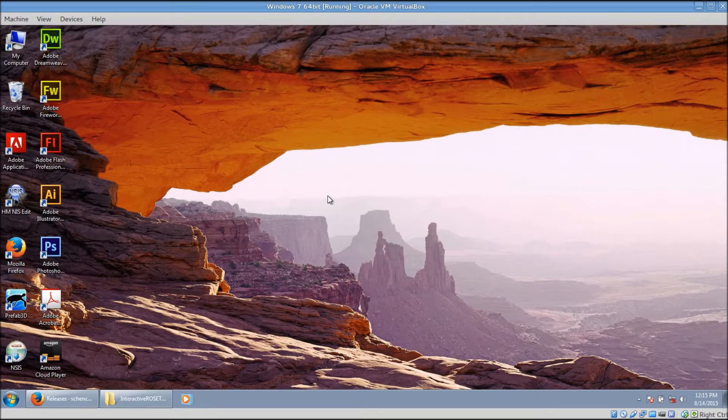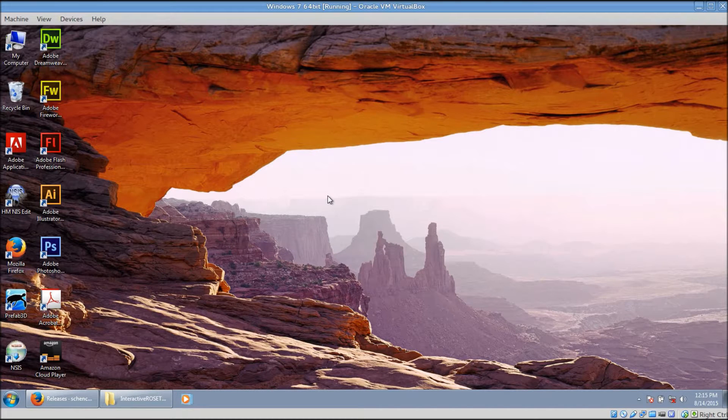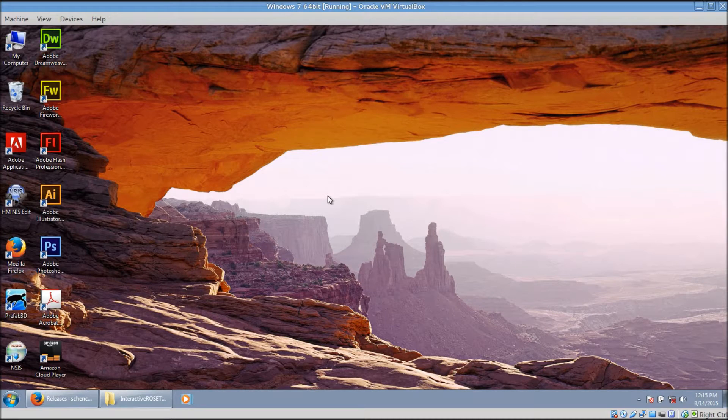Hello everyone. In this video, I will be showing you how to download and install Interactive Rosetta for Windows computers. The process has been simplified quite a bit and only requires using two installers.